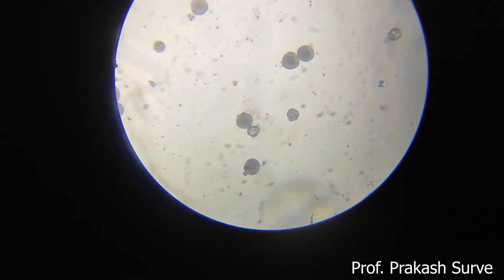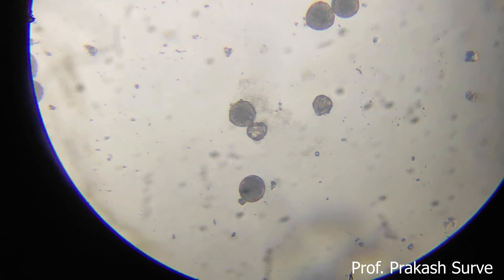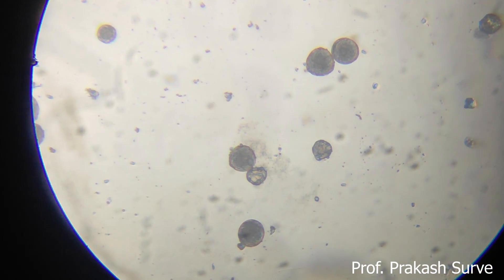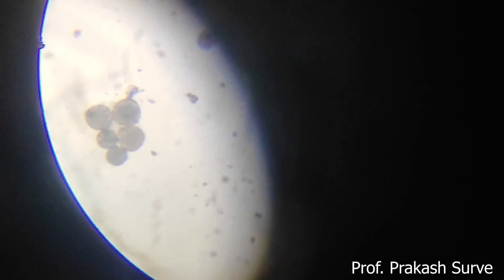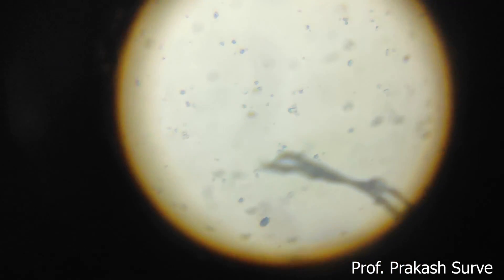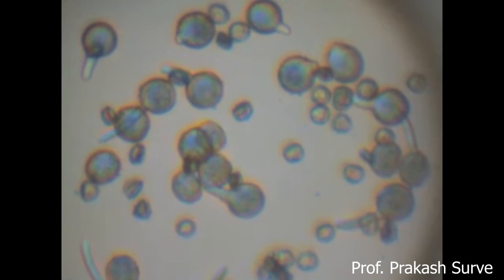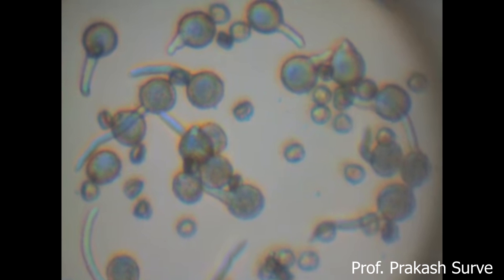What we find here: a number of pollen grains are present which are in the initial stage. After 30 to 40 minutes of incubation, all the pollen grains will germinate. In the initial stage you can observe that all the pollen grains are present. After 30 to 40 minutes, the pollen grains start to germinate.